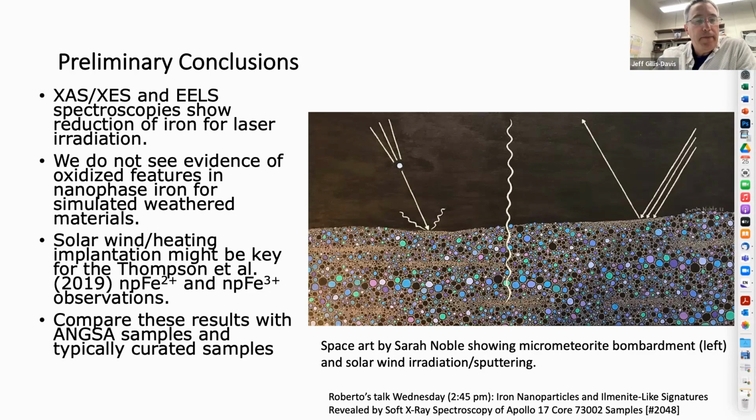Got it. The reason I'm asking is because those variations that you're seeing look a lot like the variations we see at the K edges with anisotropy. And I'm wondering, when you spread the powders out, if you're somehow inducing preferred orientation, because the beam is polarized, of course.